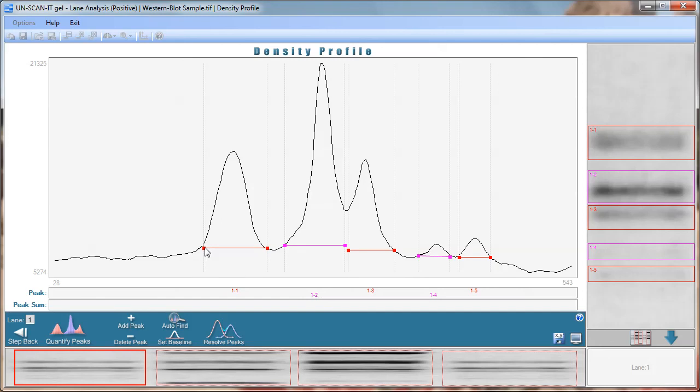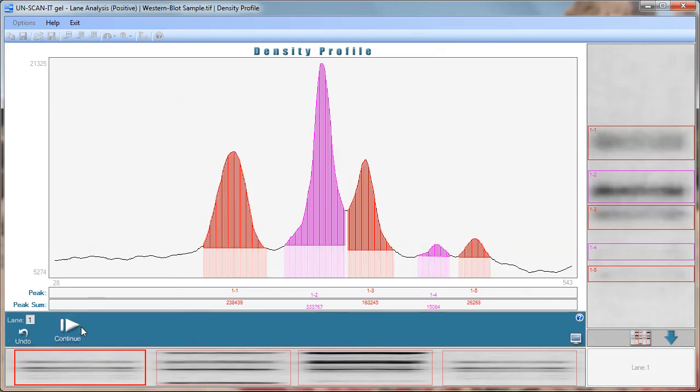After all the peaks and baselines have been assigned click the quantify peaks button. The software will visually display and store the area above the background that is assigned for each peak in that lane.